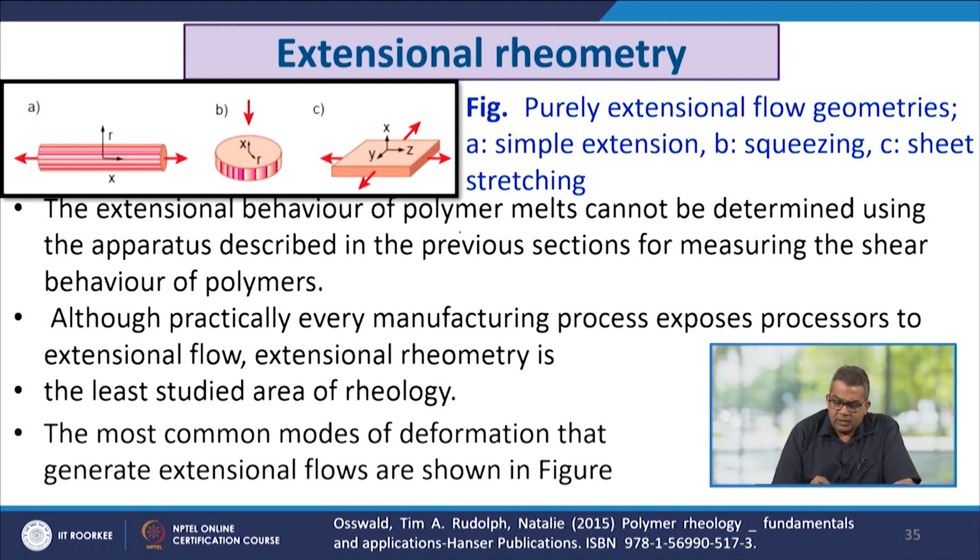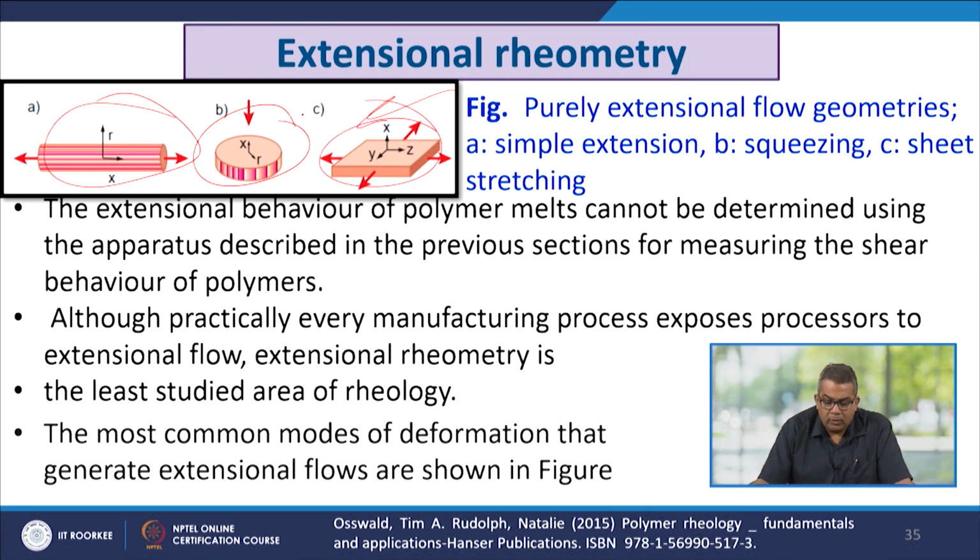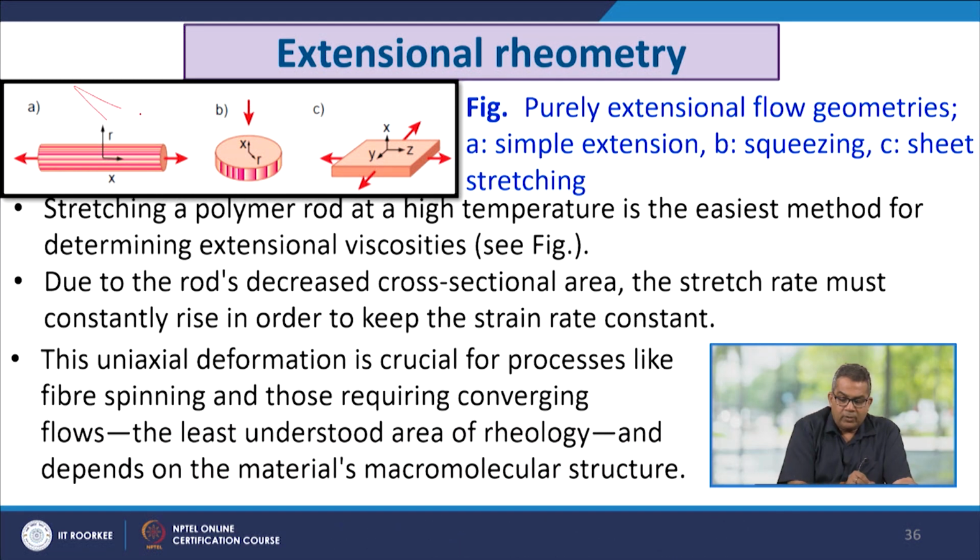Now, these are the exploratory extensional flow geometries like simple extension, this is the squeezing, this is the sheet stretching. The extensional behavior of the polymer melt cannot be determined using the apparatus which we discussed in the previous section for measuring the shear behavior of polymer. Although practically every manufacturing process exposes processors to extensional flow, extensional rheometry is the least studied area of rheology. The most common modes of deformation that generate extensional flow are shown in this particular figure.